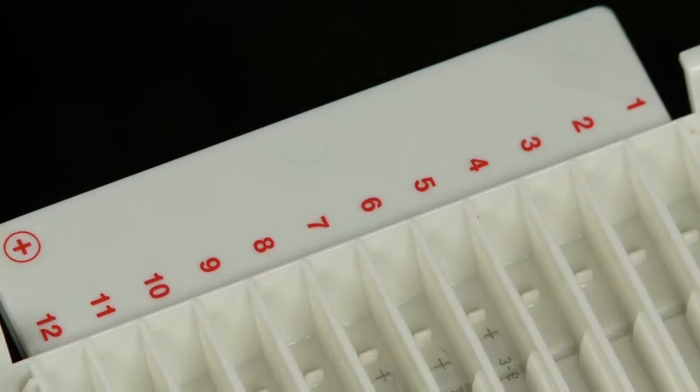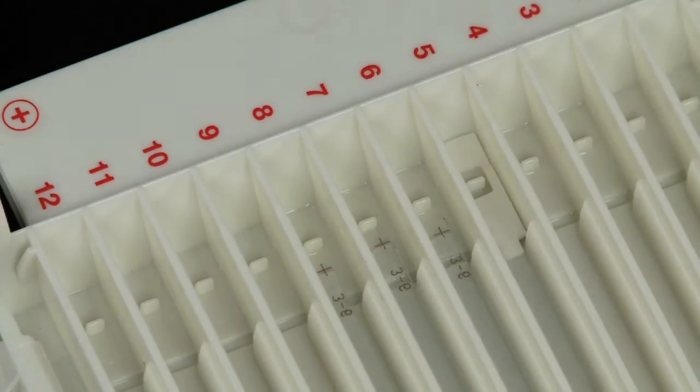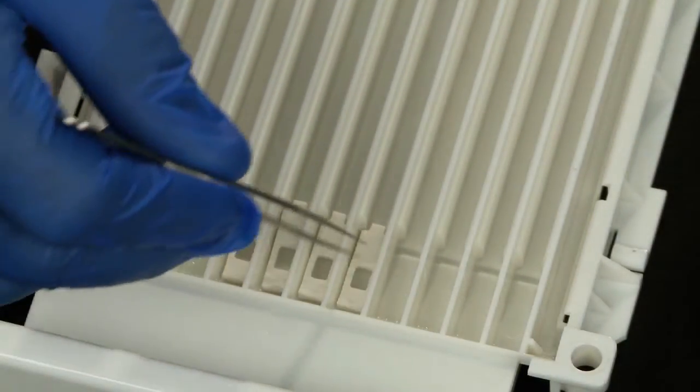At this point, you can add electrode wicks if you choose. Pre-wet the wicks and place them at the ends of the tray on top of the IPG strip.